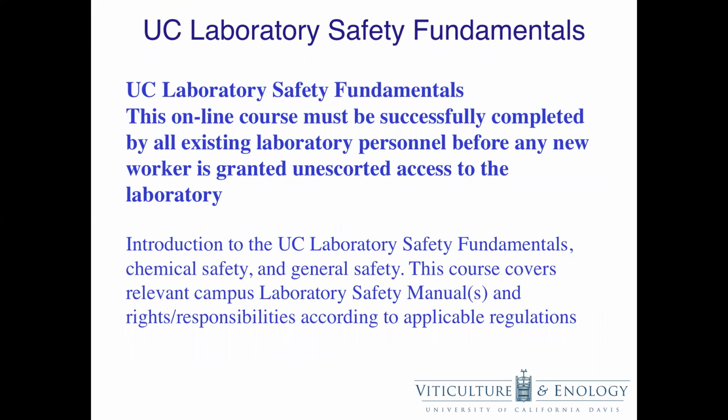UC Laboratory Safety Fundamentals is an online course which must be completed by all laboratory personnel before given access to the laboratory. It is an introduction to laboratory safety fundamentals, chemical safety, and general safety. It covers relevant information discussed in the UC Davis Laboratory Safety Manual and rights and responsibilities according to applicable regulations.